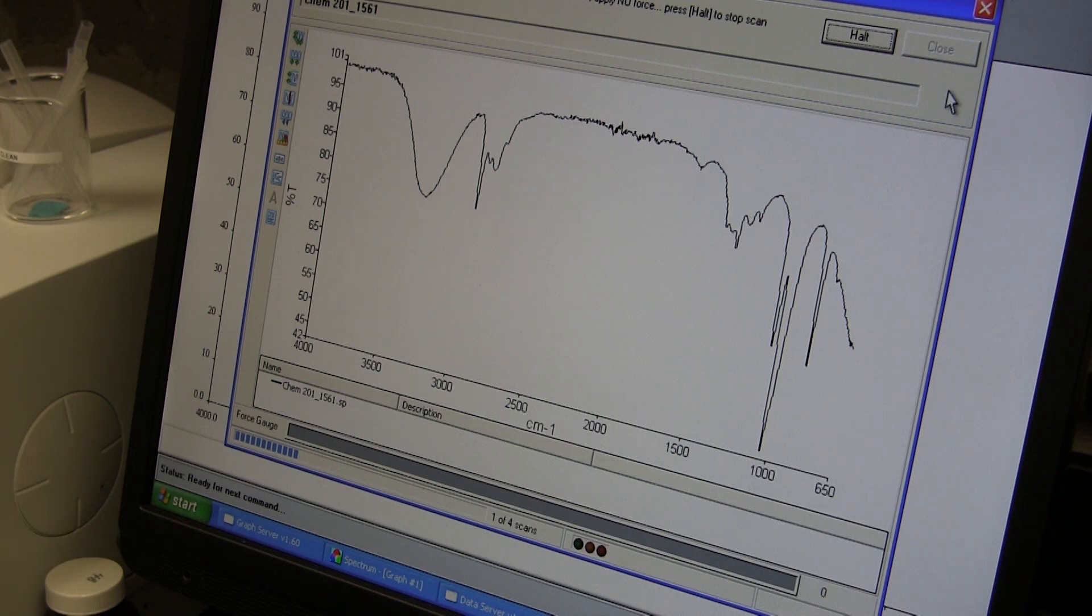Here we see a spectrum being collected on one of our FTIRs. We can see that some frequencies are absorbed more than others, depending upon which bonds or functional groups are present in the sample.